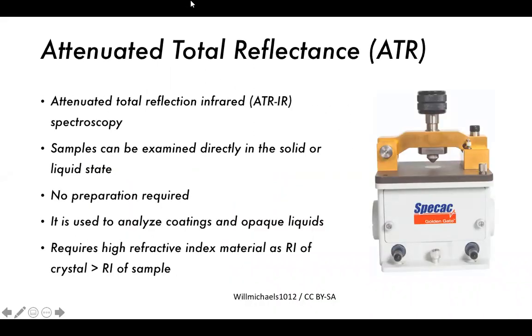So as I mentioned earlier, attenuated total reflection, this ATR method, is really useful. What it does is it effectively analyzes only a very small portion of our sample, which is directly placed on top of a window. This window is usually a diamond crystal or some sort of zinc crystal to measure our infrared spectroscopy.